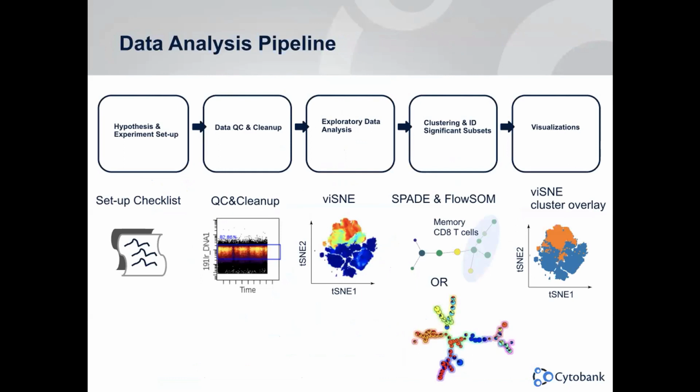One more time, here's a summary of the data analysis pipeline within Cytobank. Once you have your hypothesis and experiment design after data acquisition, the first thing is data quality control and clean-up to get single live quality data. Then the data will be compensated and transformed before running machine learning algorithms.